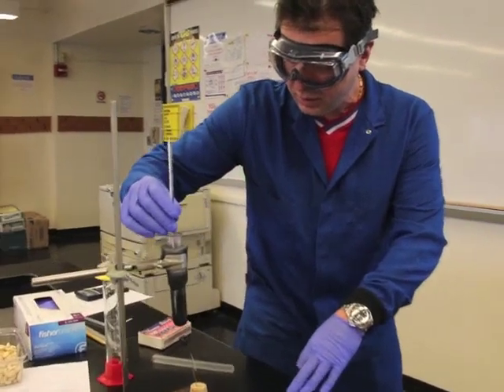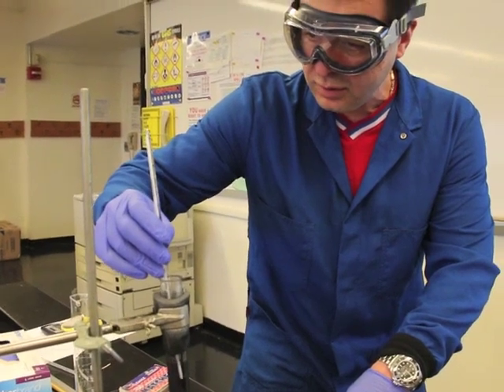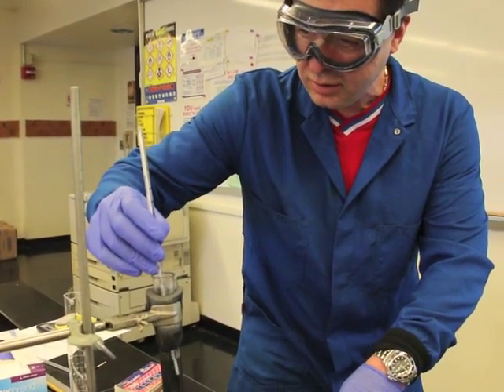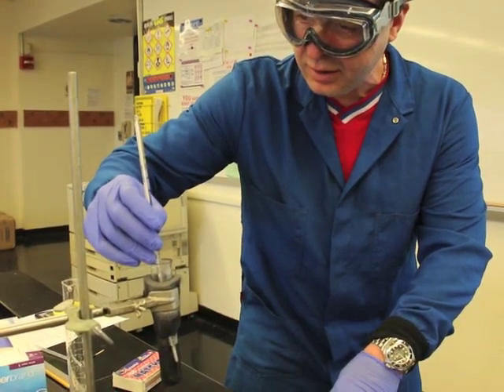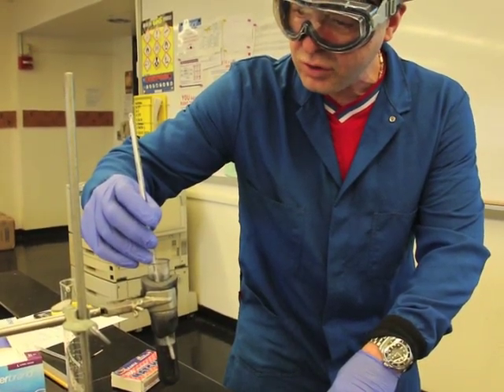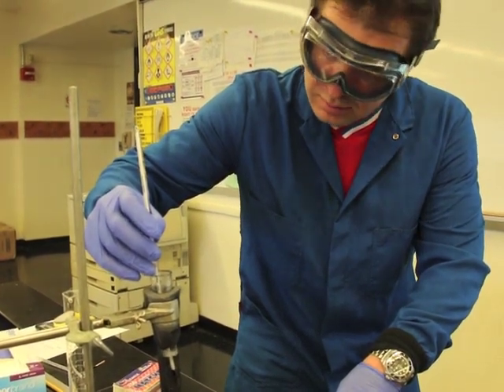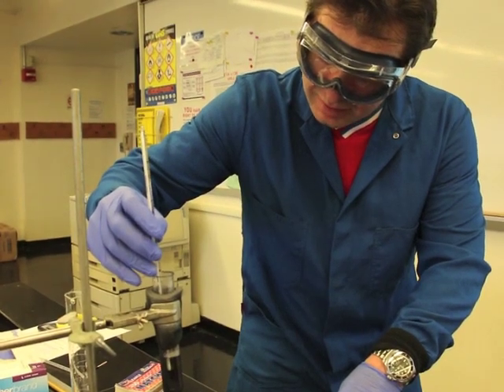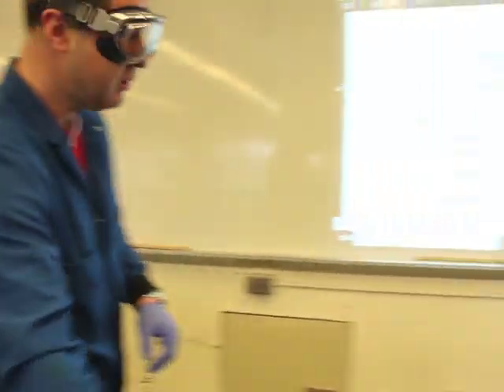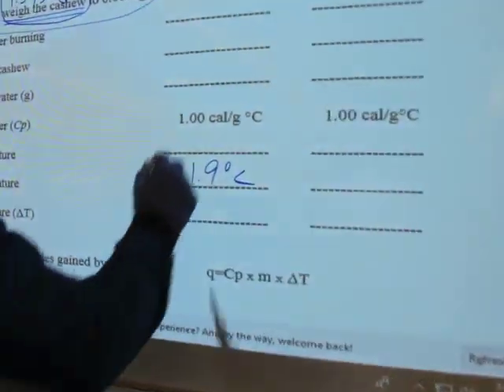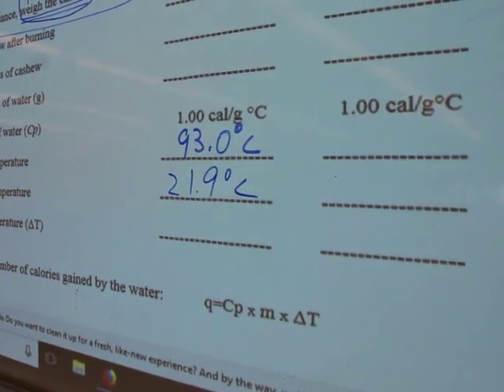I'm going to stir it a little to make sure that all of my water, every part of it, has the same temperature. I'm holding right in the middle, not touching any sides, and actually the temperature here is 93.0. That's my final temperature.